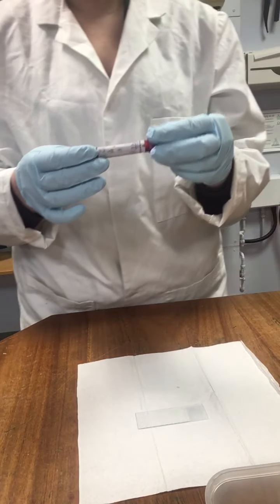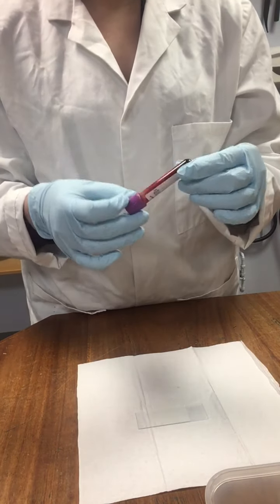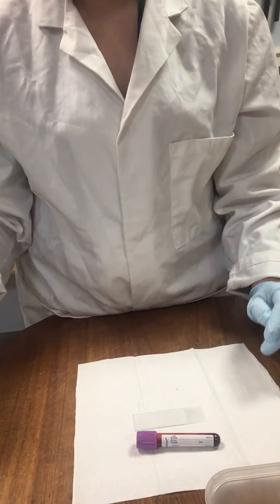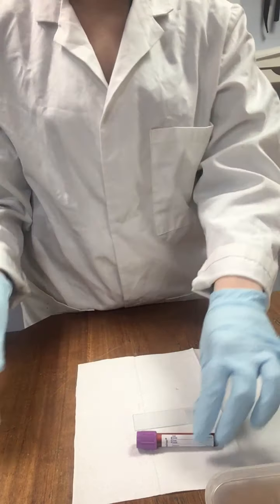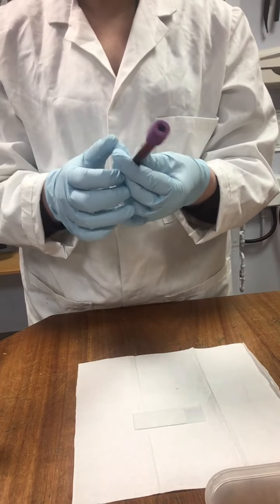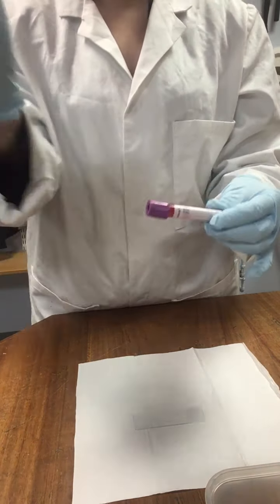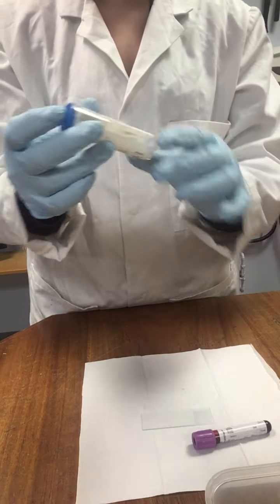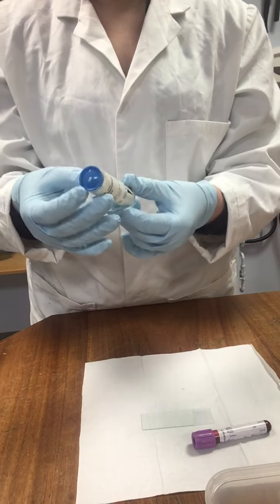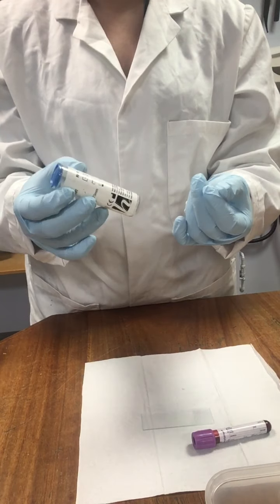So once we've reconstituted our sample, we want to make sure that we get everything else ready. So just pop your sample down. Now normally, because this blood sample has already got anticoagulant in it, it's an EDTA tube, we do just want to use a plain hematocrit tube, which is our blue top tubes. They don't contain any anticoagulants, we're not doubling them up.